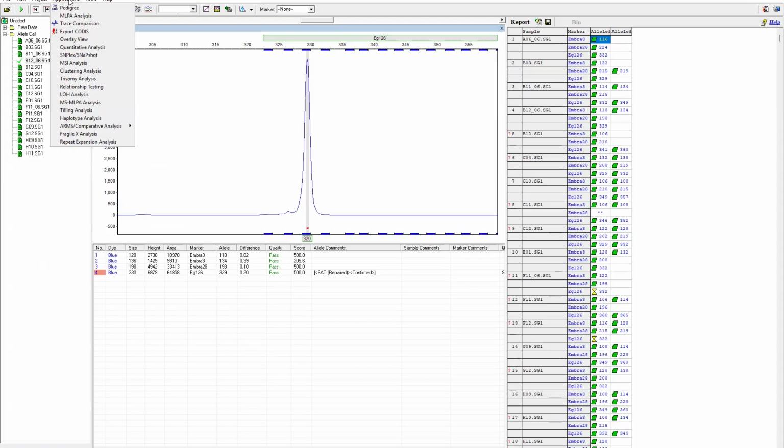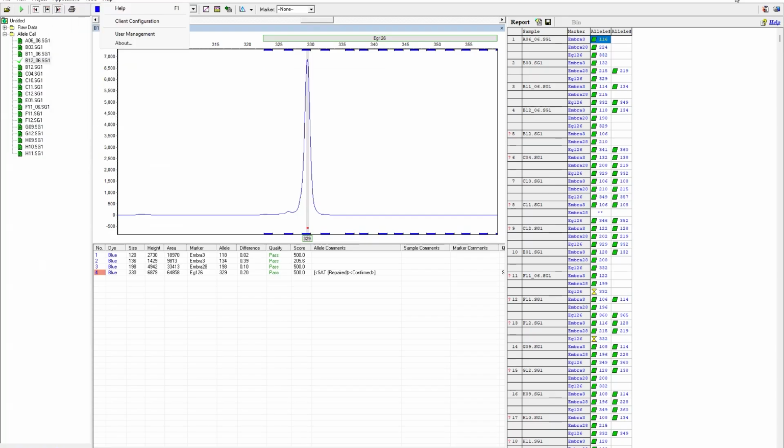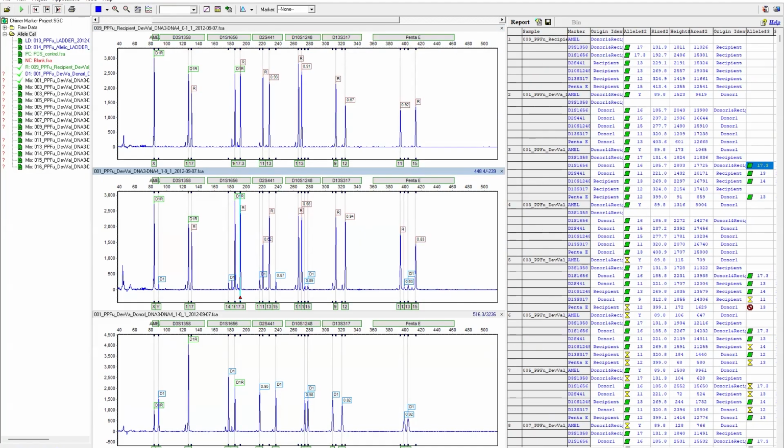Next, we'll take an overview of ChimeRMarker. So next, let's take an overview of chimerism evaluation and monitoring post-genotyping that is routinely done using human identity PCR multiplexes to monitor chimerism status. ChimeRMarker software has the same user-friendly interface and rigorous pattern match size calibrations that we just reviewed in GeneMarker.